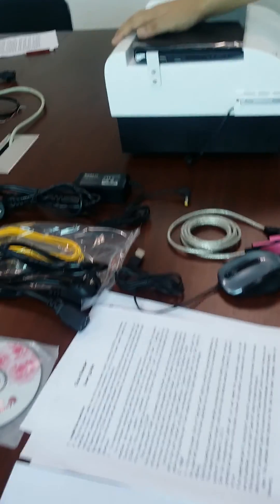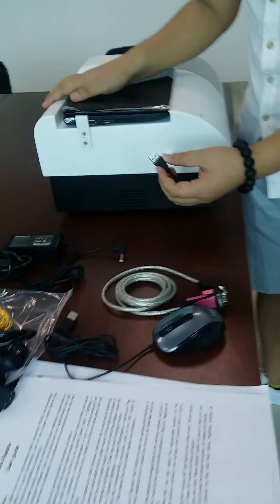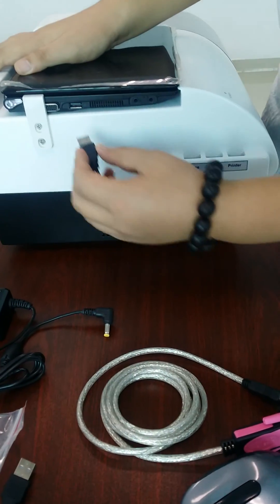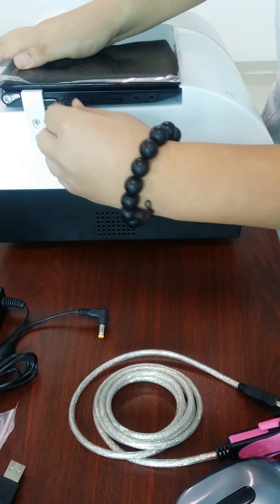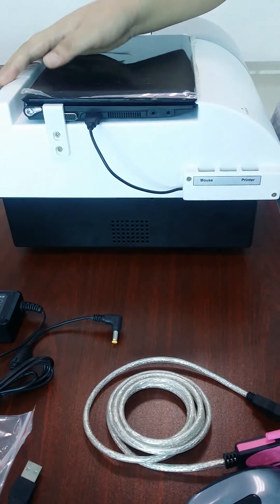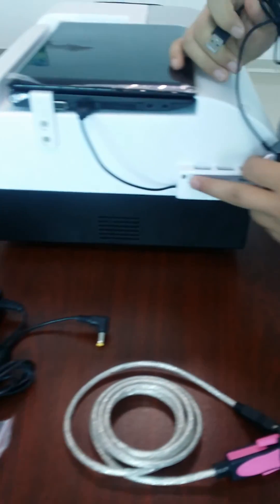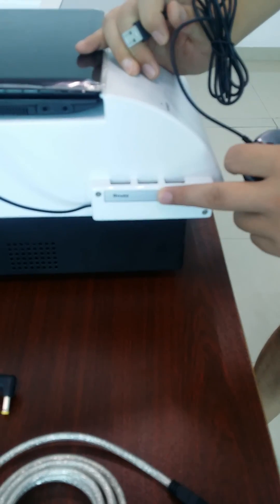Now let me show you how to install the machine. First, you will find the USB cable — this is connected to the machine.